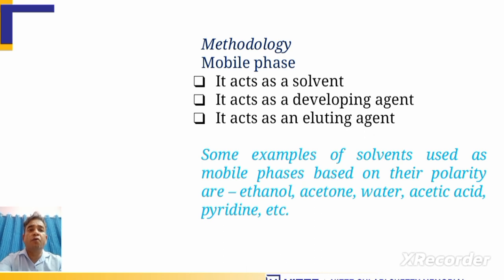Now look at the role of the mobile phase. It is not only an eluting agent; it also acts as a solvent and as a developing agent. What does this basically mean?